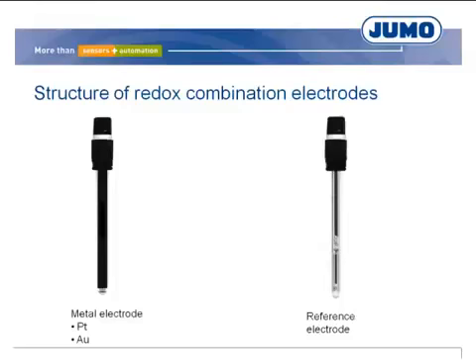The potassium chloride reference electrode is normally used in measurement technology. This electrode is better suited to industrial applications than the hydrogen electrode. The reference electrode has to deliver a constant potential, against which the redox potential of the measurement solution at the metal electrode is measured.